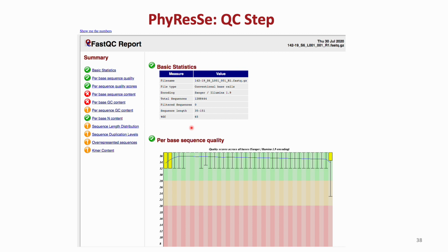So consider that after the QC analysis, you see a GC content of, for example, 40%, and you can be suspicious of the bacteria that you have sequenced, because MTBC should have a GC content above 65%. So when you see 40%, it means that you don't have MTBC in your sequence data.